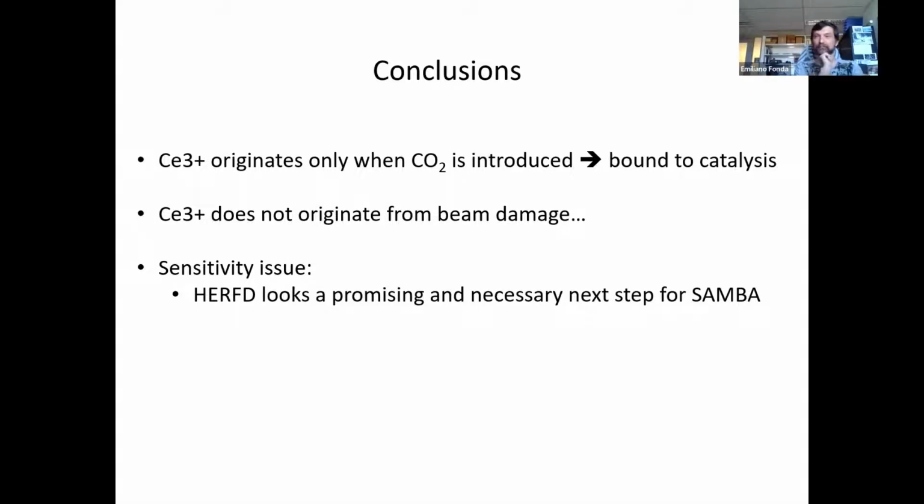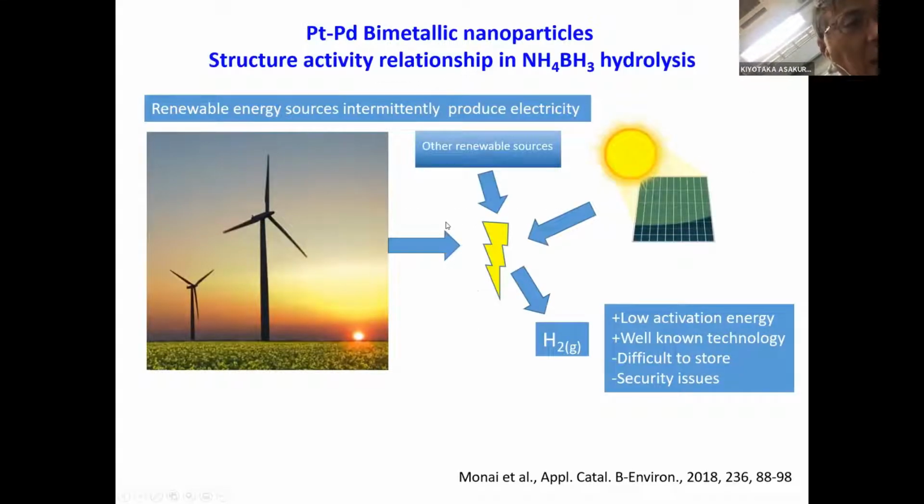Okay. So I'd like to ask you about the instrument. You said in the first part of your talk that the monochromator is used. And I'm very much impressed that the spot size doesn't change with energy. So it means the curvature is changing with energy. Is it correct? Is this dynamical focusing? So we have this painful task to coordinate at least 3 to 4 motors for a scan. Our difficulty in making it was to coordinate the motors appropriately.